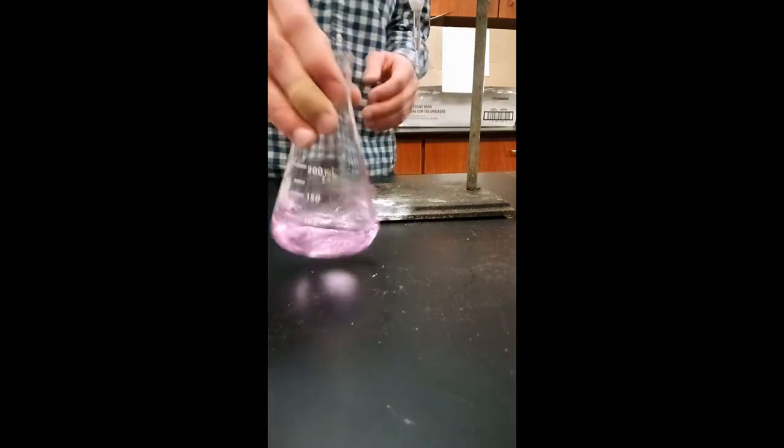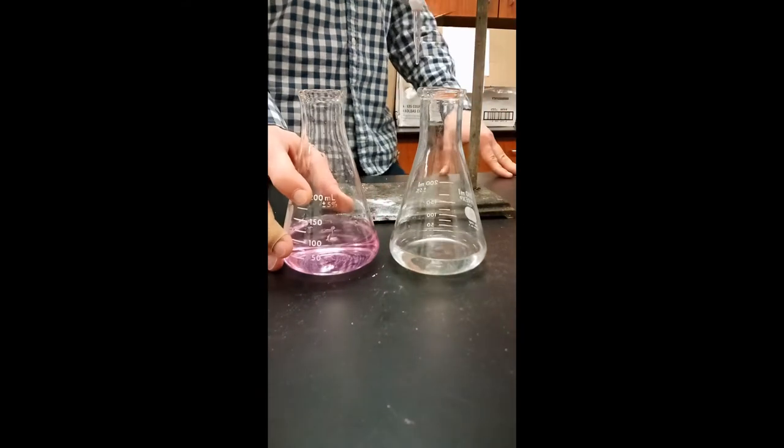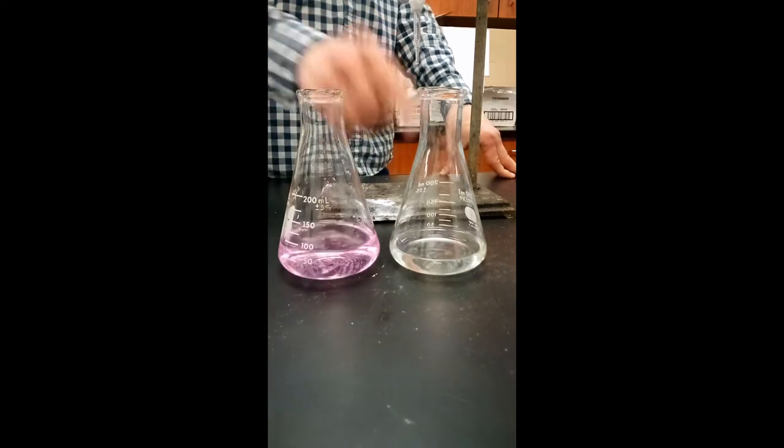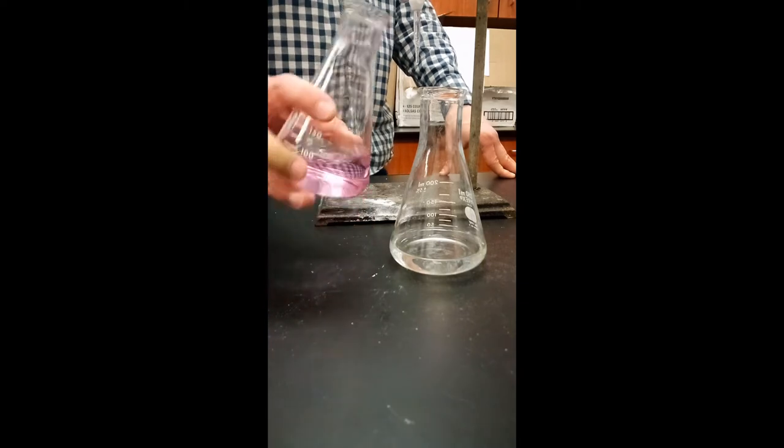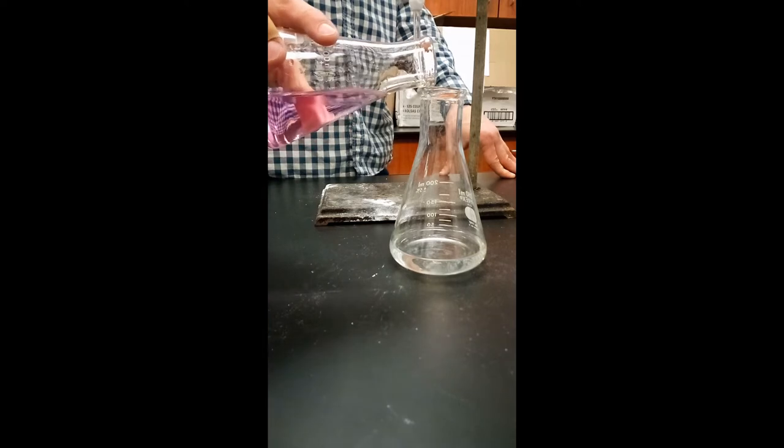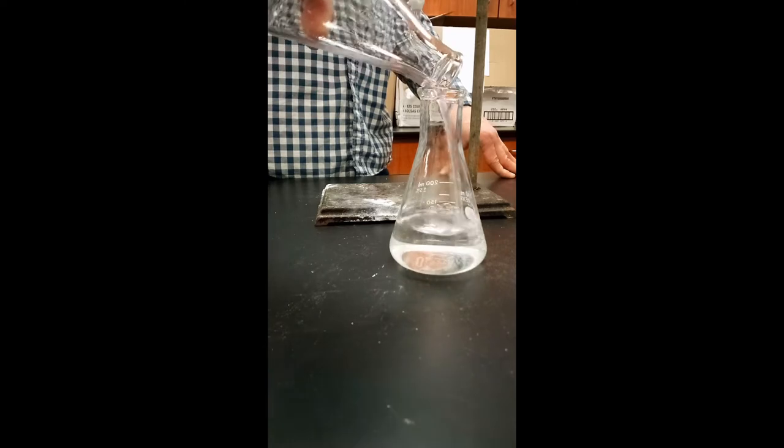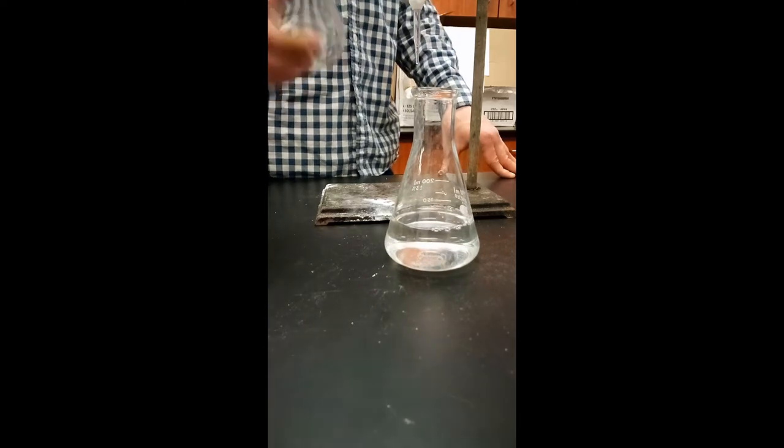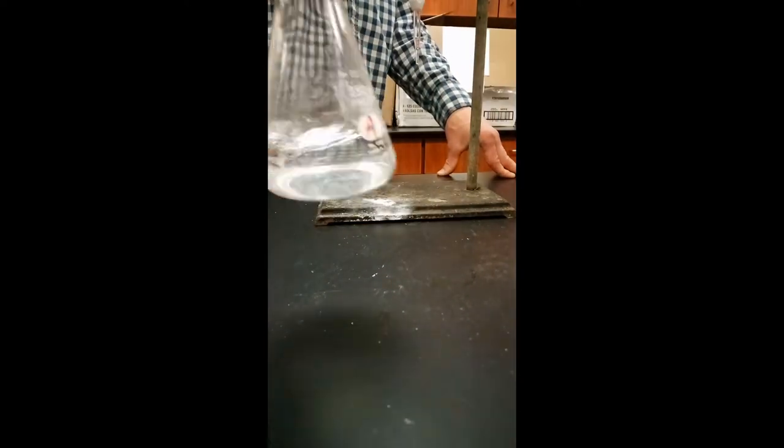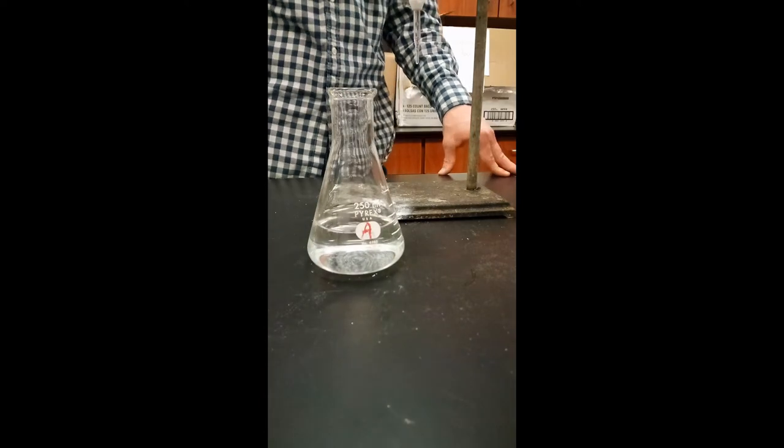So then we'll take this solution which we just neutralized with the base, KHP being the acid in this reaction with the base sodium hydroxide, and we'll add it to the other 50 milliliters of the KHP that we had separated earlier, forming our buffered solution. You'll notice since we added more acid, it's gone back to clear, but we know it's buffered because it has the appropriate amount of sodium hydroxide in it as well.